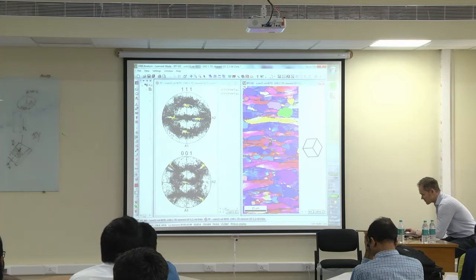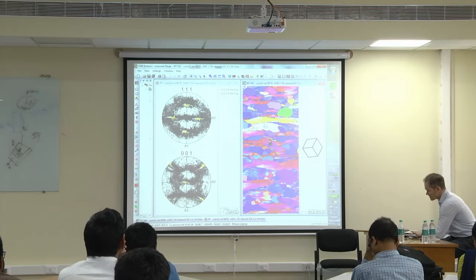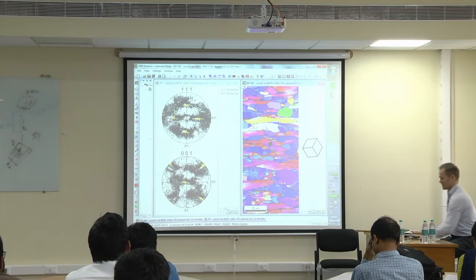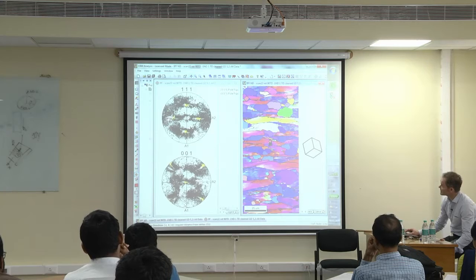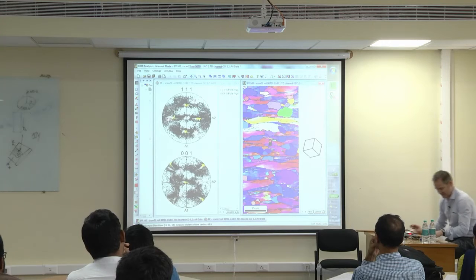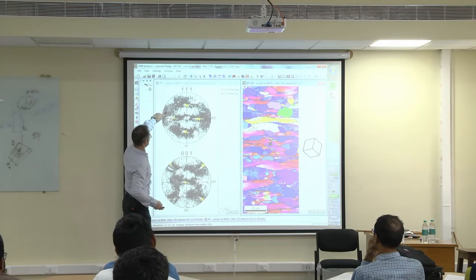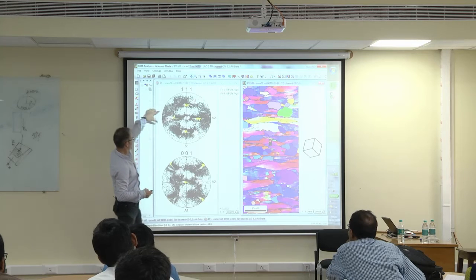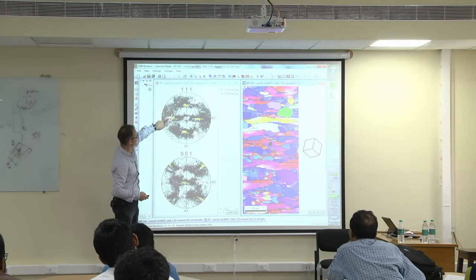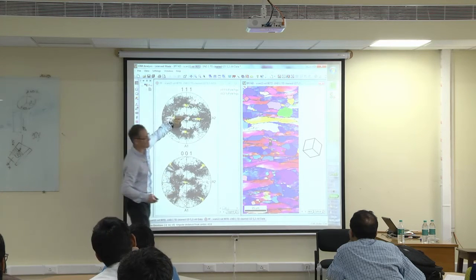And let's go for this plotting here. Coloring it. Yes. Okay, and again, it appears well here in the middle, yeah? Overlaying with the green grain, that's why we don't see the green one any longer. And it has its peaks here. In contrast to the green one, which has really just one point, it is spread out. And you will see, actually, there is a 30-degree rotation between the green and the pink. Green and pink, 30 degree, all rotating around that.